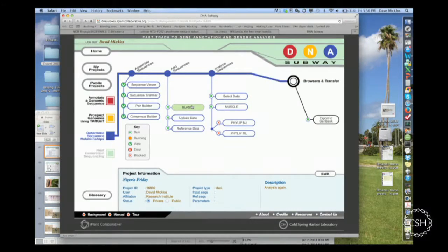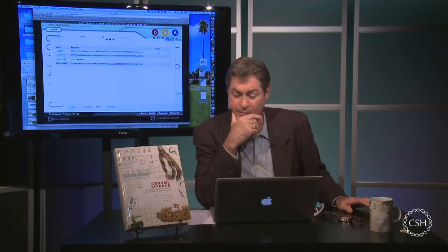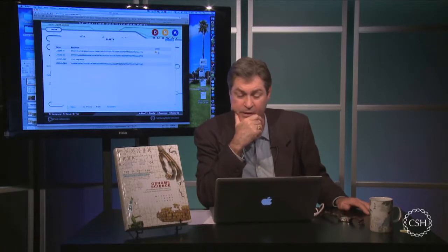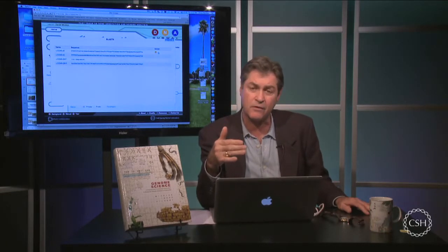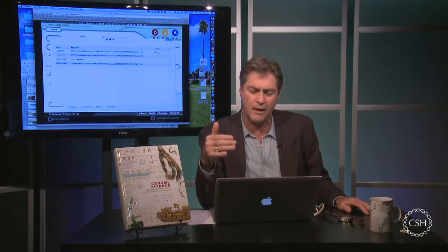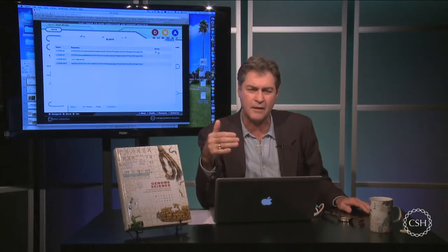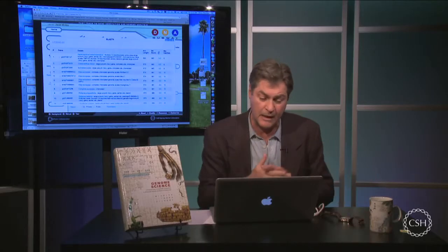Now while I'm at it, I'm going to BLAST with the other plant. That's the boundary tree, which should be this one. Now we're getting a real BLAST search because this one wasn't cached because I hadn't done one in a long time, so it cleared the cache. So this is the amount of time you can expect to do a real BLAST search. This is calling the BLAST server at the iPlant Collaborative, which is essentially a mirror of the BLAST search at the National Center for Biotechnology Information, or NCBI. But you can see it came back pretty fast.